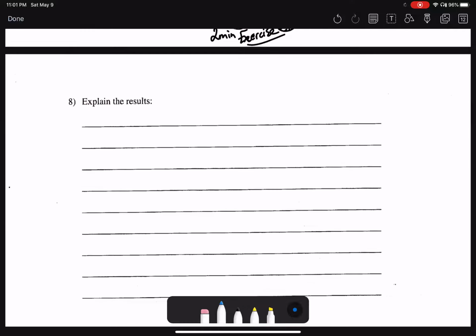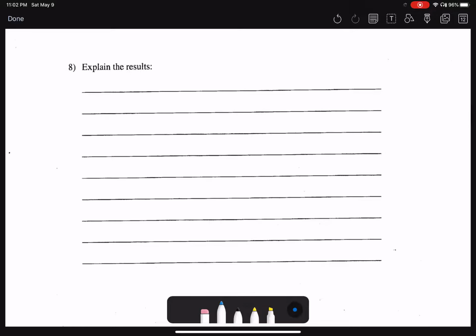And why is that? Well, remember, what are we really measuring by this simple little assay? By measuring the time it takes for the solution to turn clear, that time is a proxy for the amount of CO2 that the person is exhaling. So the more CO2 they're exhaling, the more carbonic acid forms, the more bicarbonate forms, and the more quickly the solution neutralizes and turns clear. So why would the person exercising be exhaling more CO2? That's the next question. Let me write this all out so you can follow along with the story.